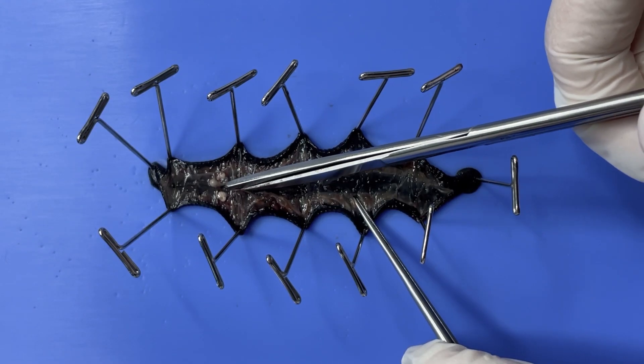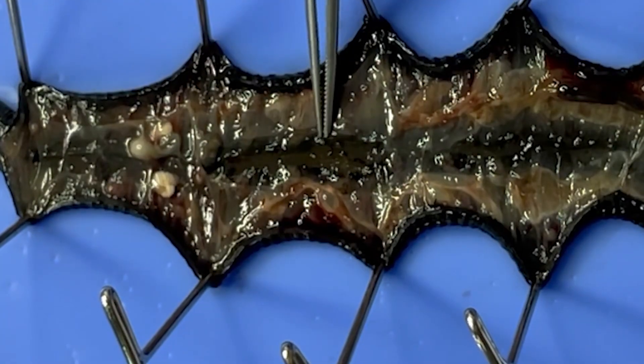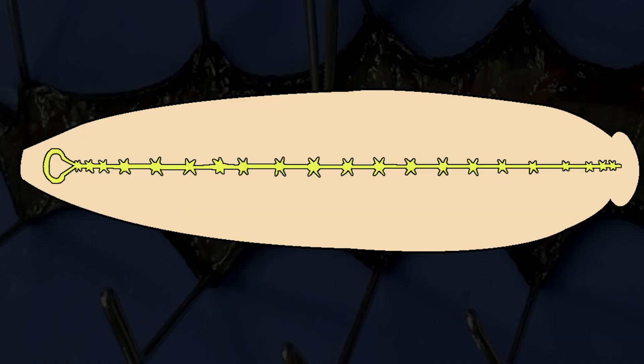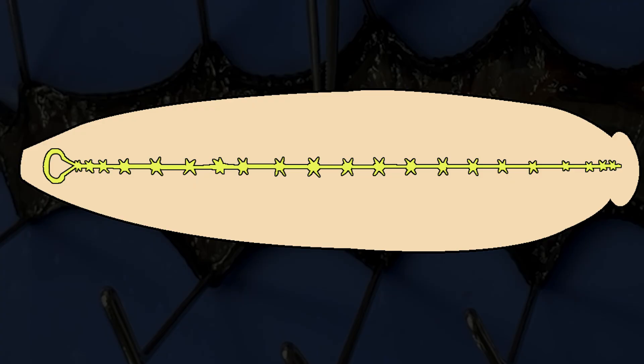Finally, if we gently split the digestive tract, you can see the ventral nerve cord. Leeches have ganglia, which are clusters of nerve cells, in each segment. They have a total of 32 ganglia from head to tail. These ganglia are interconnected but can also function independently.